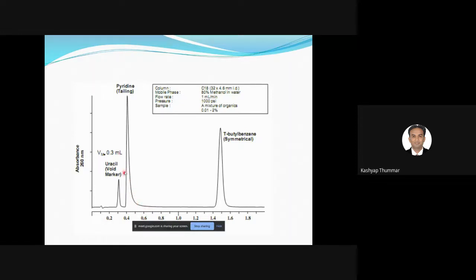So it does not have the same shape as it started. This is due to the polar interaction with the acidic silanol group of the column, because pyridine is very basic. In USP, for some basic amine drugs, a larger tailing factor is exceptionally accepted.